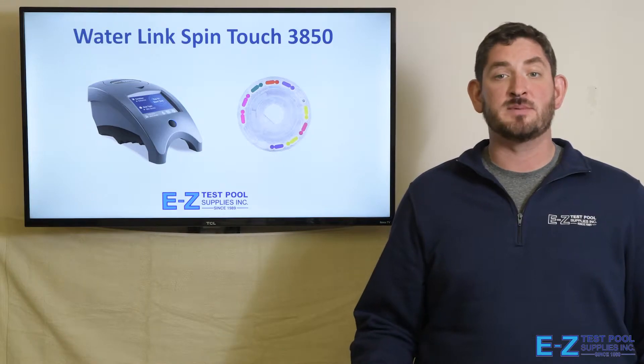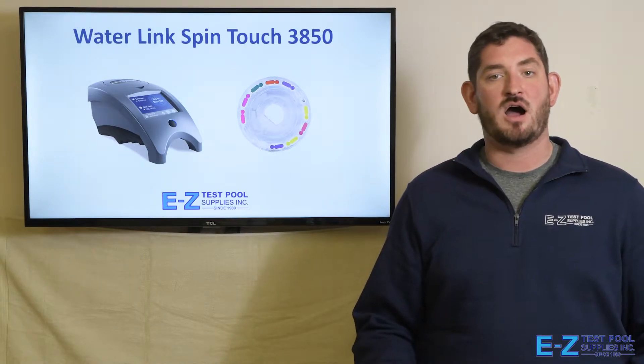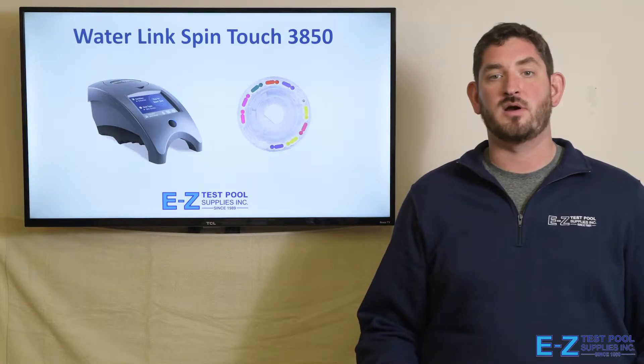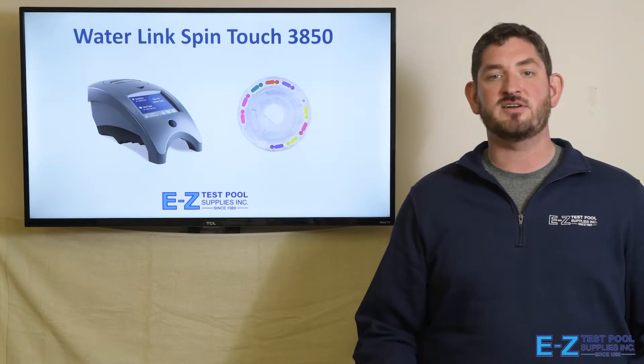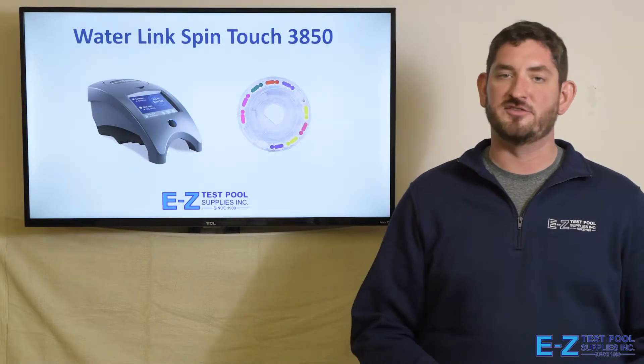Or, if you're managing a commercial pool such as a YMCA, Country Club, Condo Association, Hotel, or Waterpark, this would be ideal for you as you are able to test your water in 60 seconds and maintain a record in the cloud which is easily shared with any health department.